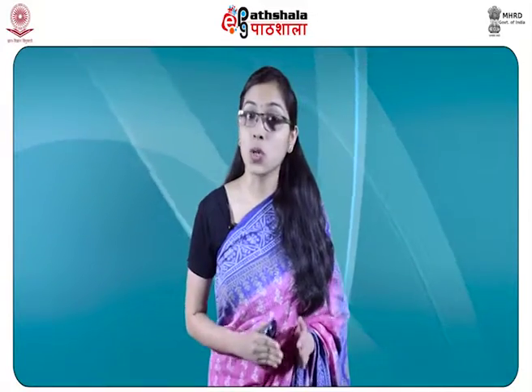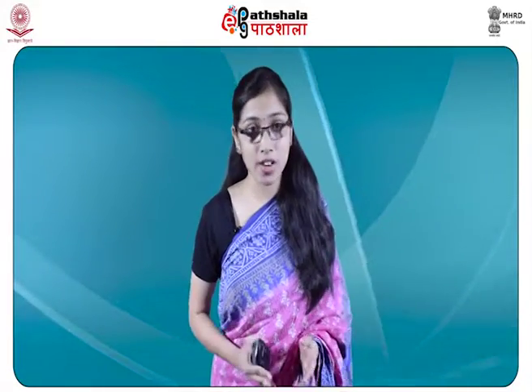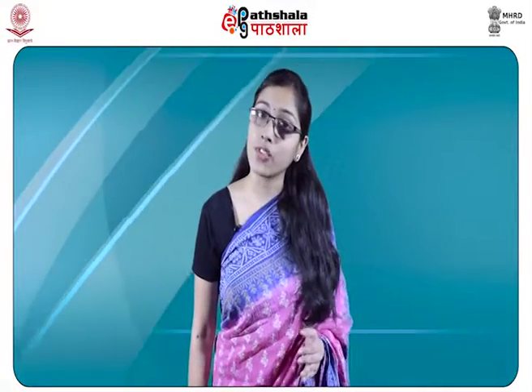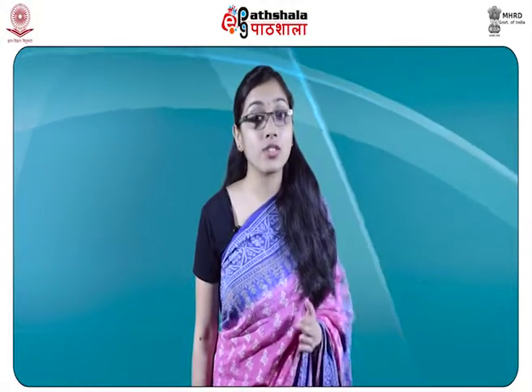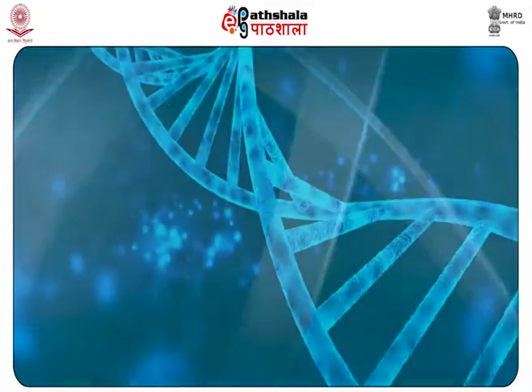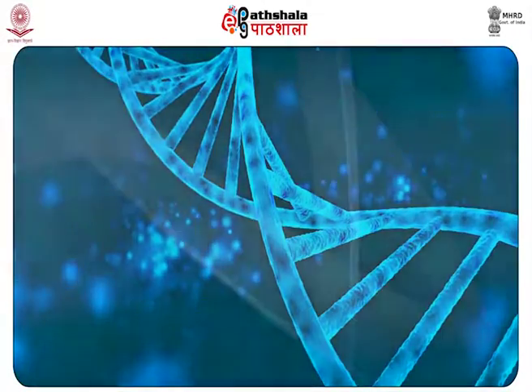While there is no doubt that the physical and chemical properties of friction ridge impressions will be affected by the extreme environment created by a fire, such as elevated temperature, water exposure and high levels of gases including carbon monoxide and carbon dioxide, both casework and research work indicated that friction ridge impressions and, more recently, DNA can survive such exposures.